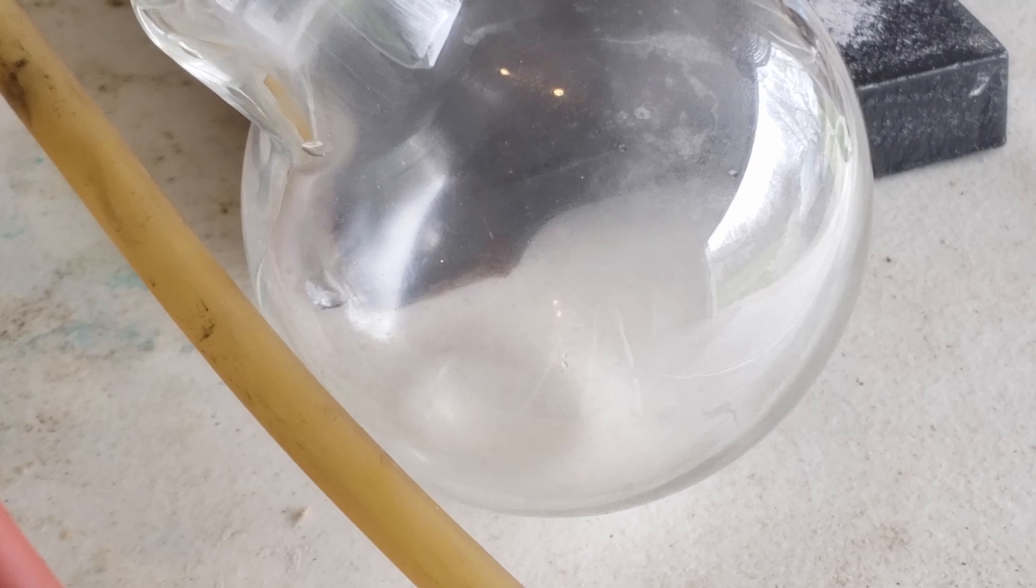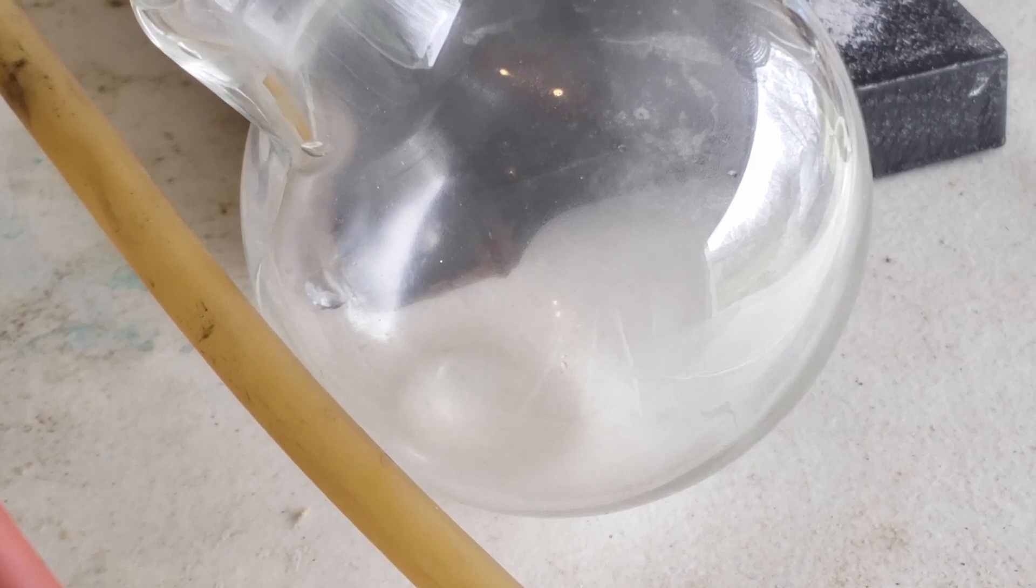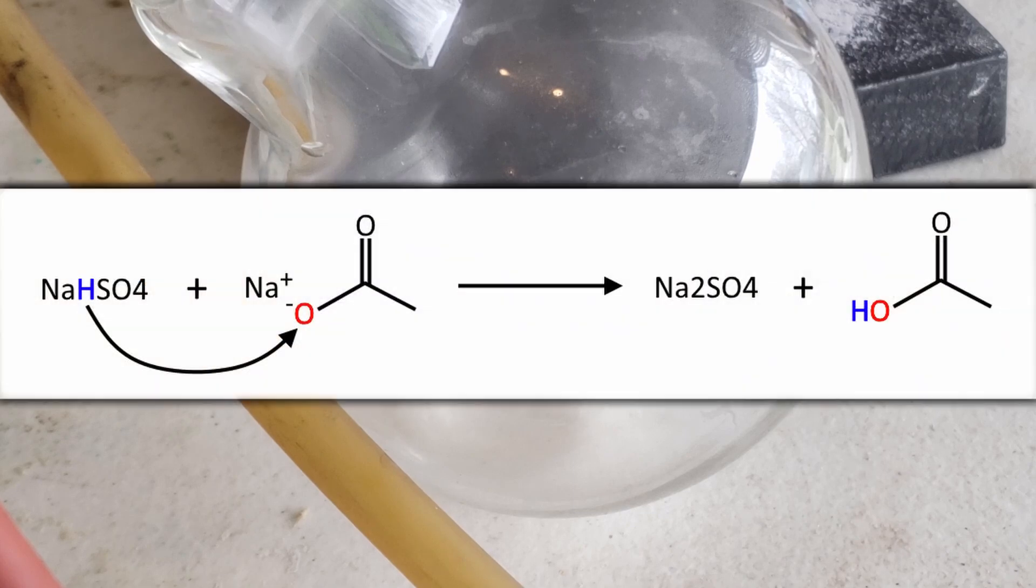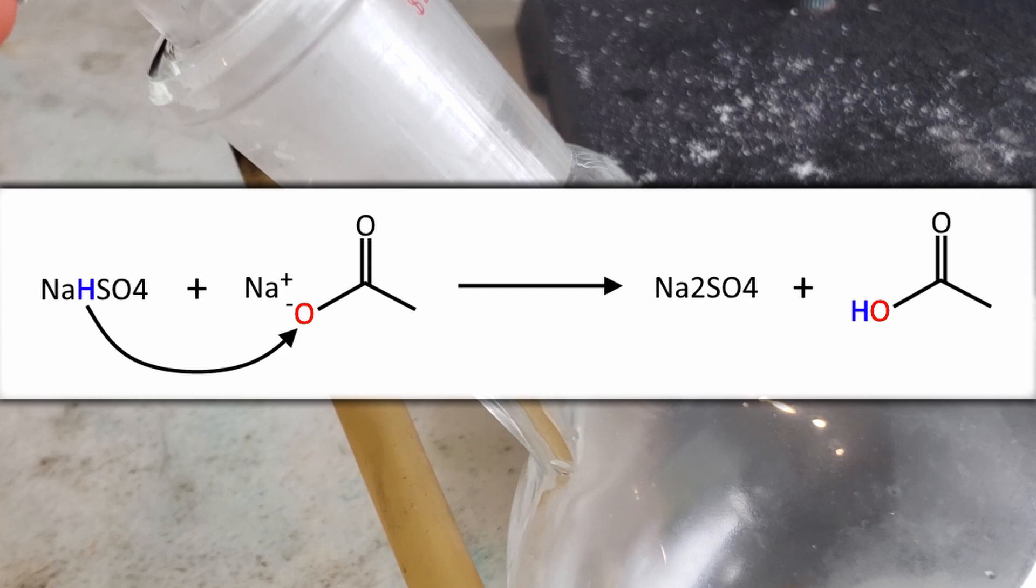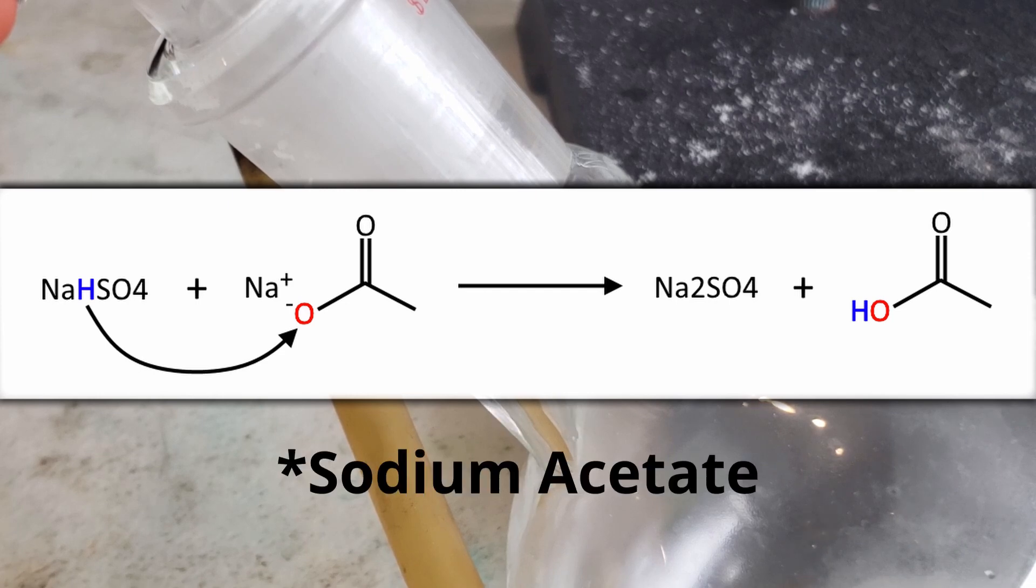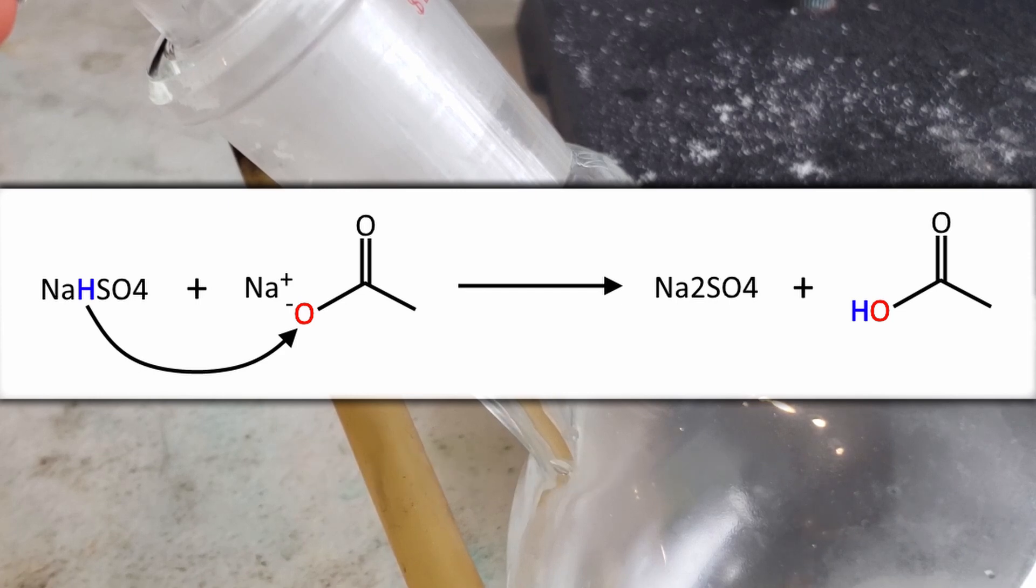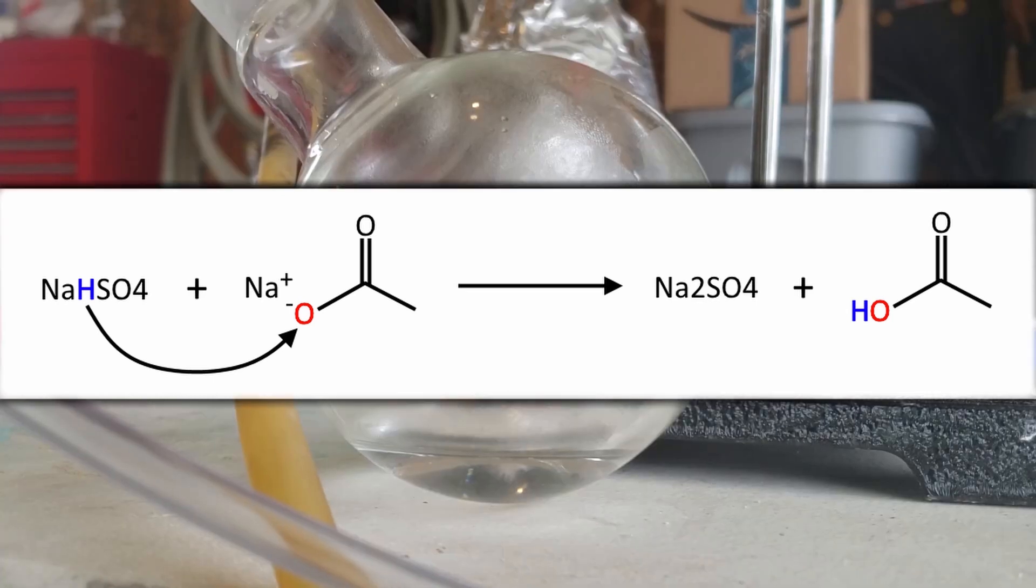After a few minutes, the first drops of distillate began to come over. What's happening here is the sodium bisulfate, being a stronger acid than acetic acid, protonates the sodium acetate, giving us acetic acid and leaving behind sodium sulfate as a byproduct.